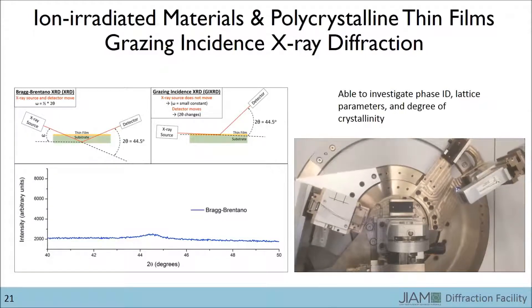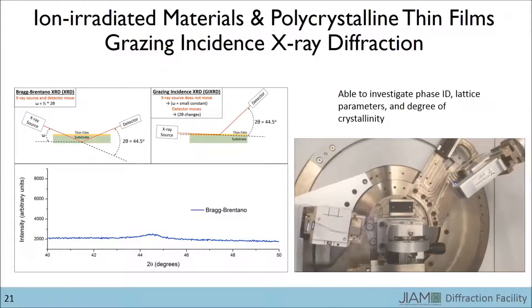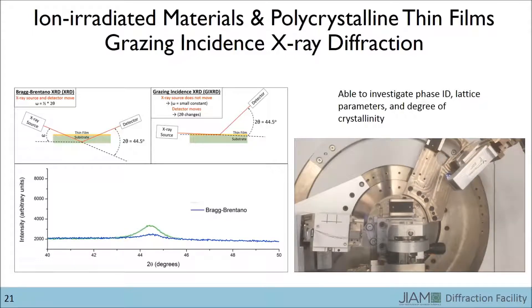Now we go to the grazing incidence configuration. The source moves to an angle of 4 degrees while the detector moves to 36 degrees. The detector then moves upward by 10 degrees and we see that the peak is larger.